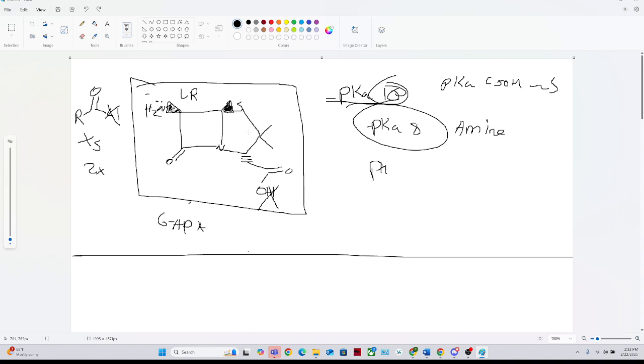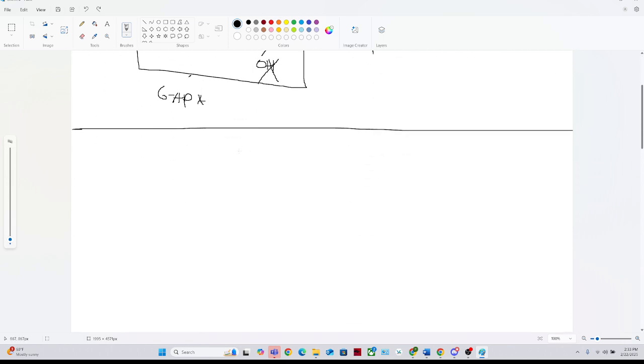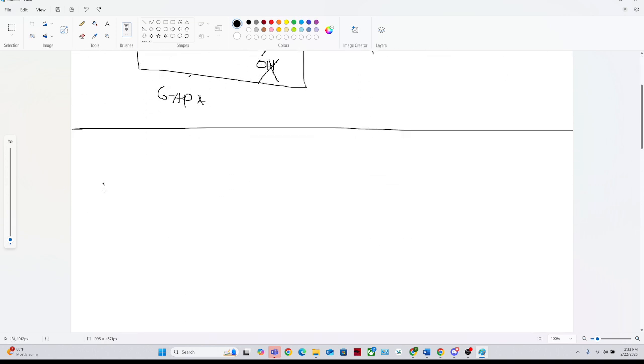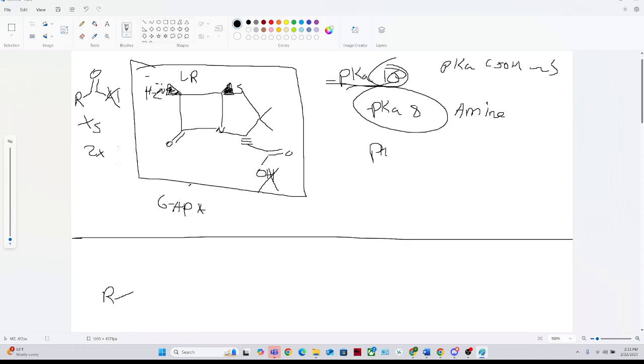And I would highly recommend, whenever you do a reaction, to say, okay, what do I have in the start, and what is the pH of my solution at the start, and everything that's inside there, including the solvent. And then additionally, when I finish my reaction, what is everything that is possibly in my solution, plus the pH of that solution as well, okay? And that's super important.